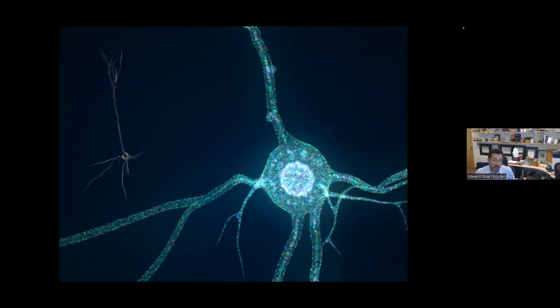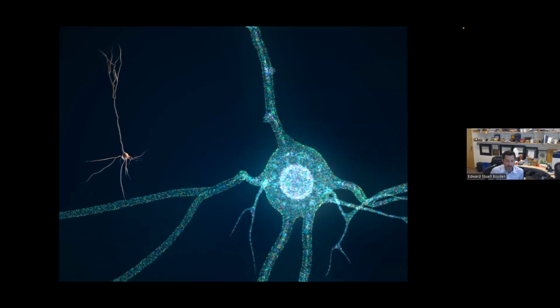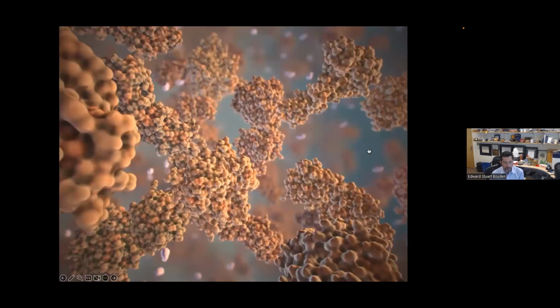So in a nutshell, what we want to do is to take a cell like the one on the left of this cartoon and pull apart the building blocks of life so they look like something on the right. A constellation of biomolecules hovering in space. Their relative organization is preserved, but they've all been pulled apart from each other. So 2 biomolecules that we're touching are now some minimum distance apart, and 2 biomolecules that are some distance apart have been scaled up by a linear factor. So, of course, this only works on preserved specimens, not living ones, but allows you to get a molecular map of what is inside the cell, tissue, organ, or organism.